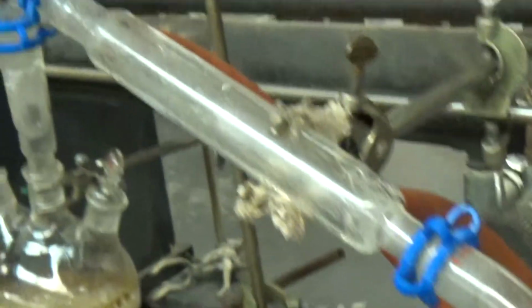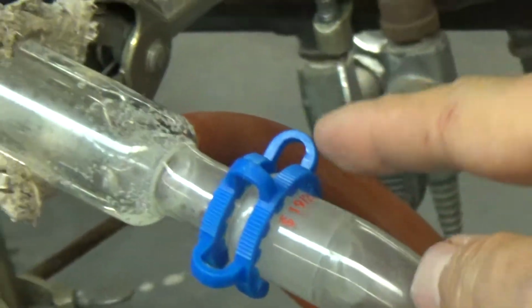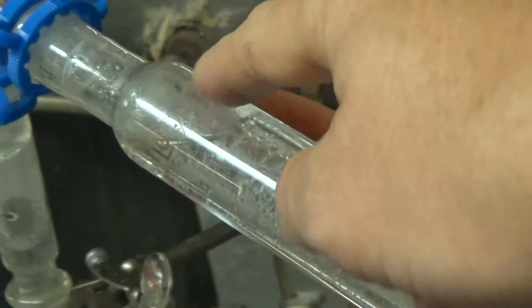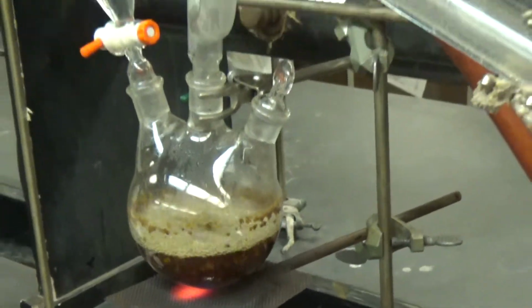It's coming out through the condenser, the cold surface of the condenser. The condenser's cold, of course, from the water. Water's coming in, coming up, and coming down. And it looks pretty cool, like it's working.